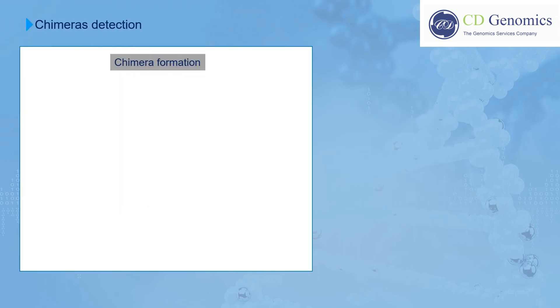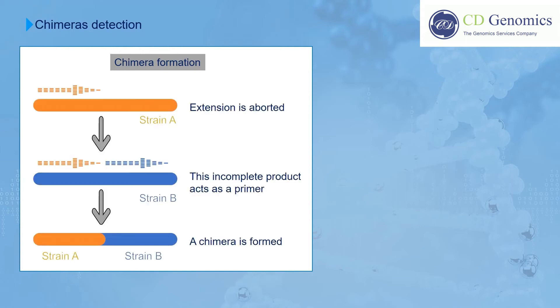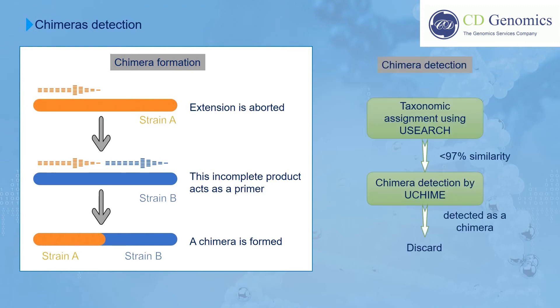Chimeric sequences formed during PCR amplification of the 16S genes are a common source of 16S sequence artifacts when using mixed templates. In the process of chimera formation, an extension from an earlier cycle of PCR is aborted. The incomplete extension product then anneals to and primes DNA synthesis from an incomplete template, and a chimera is thus formed. If a sequence matches a reference sequence with similarity less than 97% and is labeled as a chimera by the UCHIME algorithm, it is then discarded.